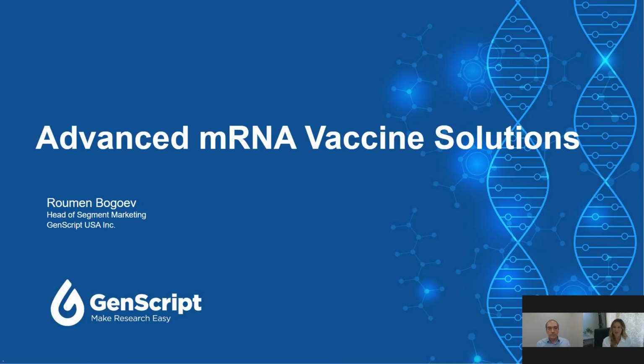Excellent. Our next question. What is the amount of plasmid that your instrument can purify per sample? Okay, very good question. There's no real cutoff of what we can purify and cannot purify with this instrument, but the performance of the instrument, the purity and the yield, is the highest in the range of 300 micrograms to 1.2 milligrams. Again, it doesn't mean you cannot purify lower or higher, it's just that the yield or the purity may not be as high as if you're in this range.